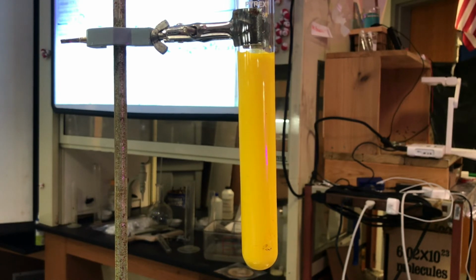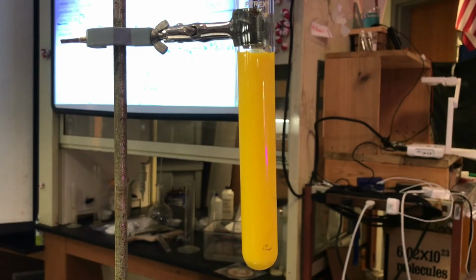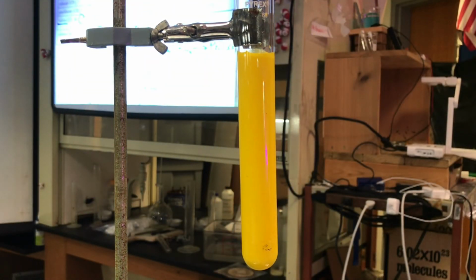The color changed, and I can't see through the solution. I can see through an aqueous solution because the individual ions are so small compared to the wavelengths. But nothing gets through a solid. It just so happens lead iodide is a very famous yellow precipitate that was used in paints, until people realized it was not a good idea, especially in homes. Kids would start eating it, because they figure it must be flavored. Having lead in your body is not a good idea. It's a heavy metal, can cause neurological problems.